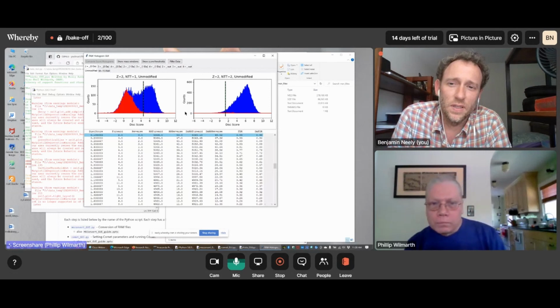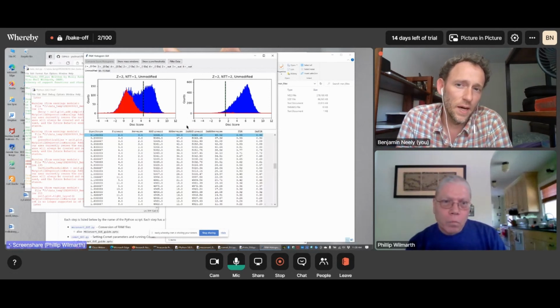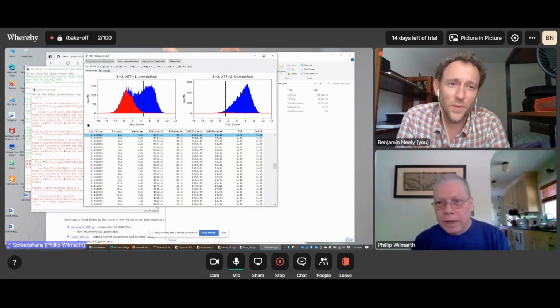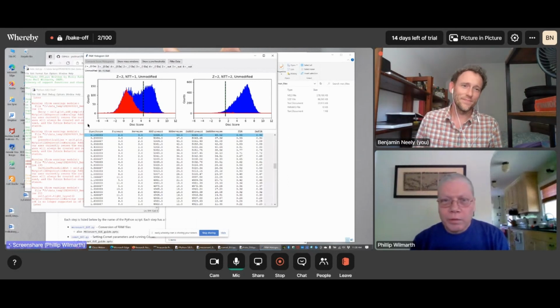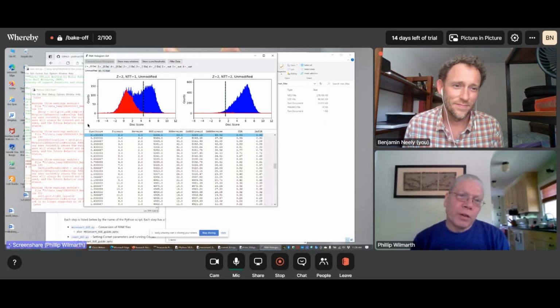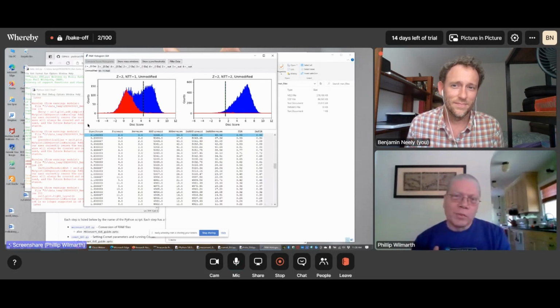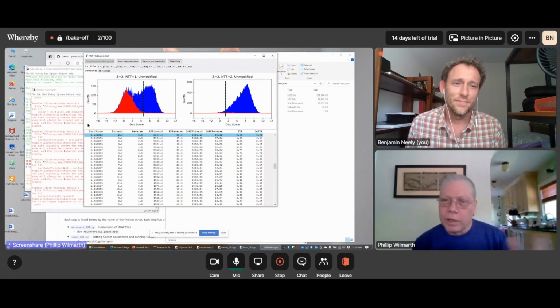Yeah. And last one, the discovery score, is that a score from Comet? It's a discriminant score. It's a linear discriminant function, pretty much the same functional form that PeptideProphet had in the 2001 paper. There's a term for the cross-correlation score, the sequence primary score, and an equally weighted term related to the delta CN, which is the gap score, the difference between the top hit and the next best hit. Then there are some minor things like the preliminary scoring function and the delta mass hiding in there, but those last two terms are very downweighted. So it's really dominated by equal contributions of this gap score and the primary search score.